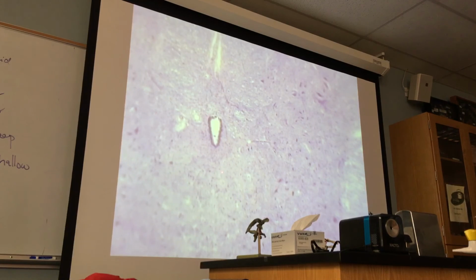In the center of the gray commissure, what do you have? This is called central canal. Remember, central canal. Where is it located? In the center of the gray commissure. What is gray commissure? A strip of gray matter connecting 2 sides of the gray matter, or 2 halves of the gray matter.